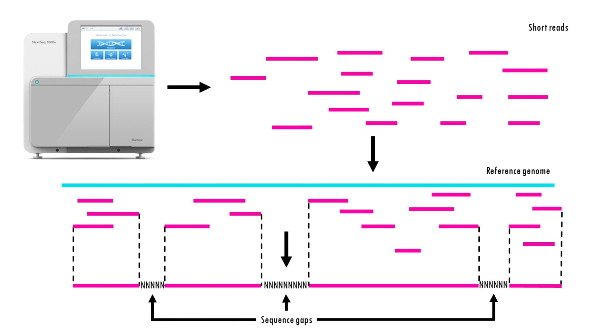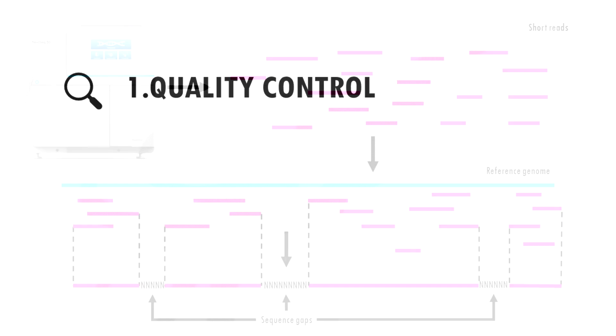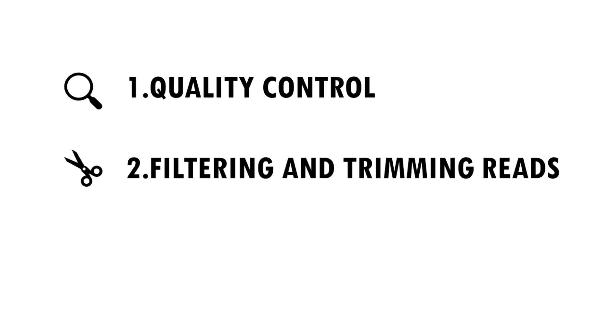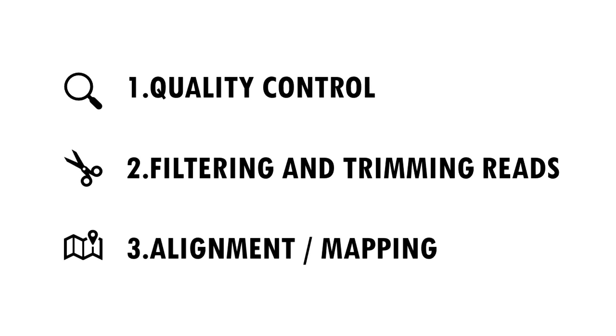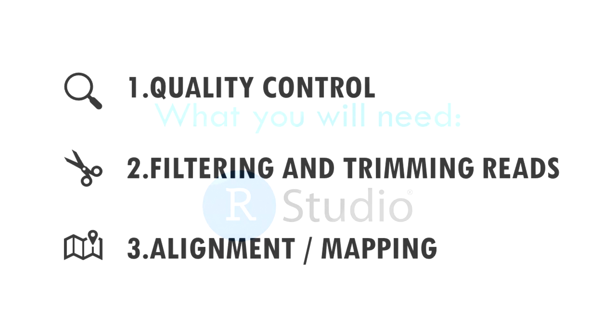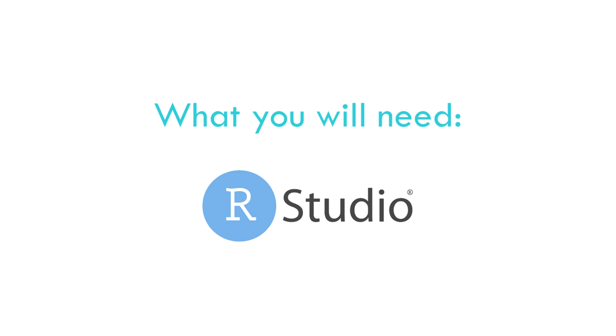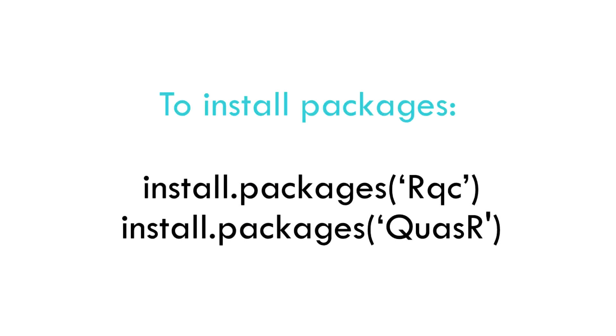But of course, before we can use the data we need to preprocess the reads, run a few quality control checks, and then align them or map them onto the genome. For this tutorial you will need R or RStudio and you will need to install the following packages.